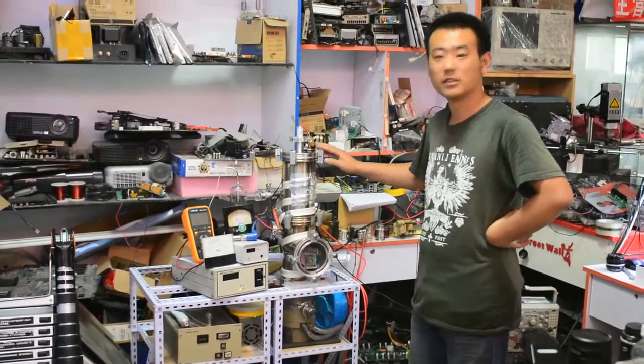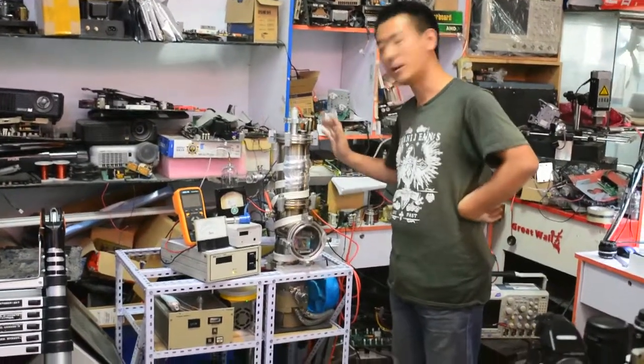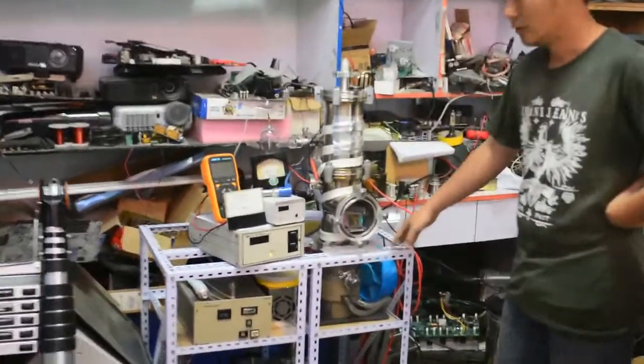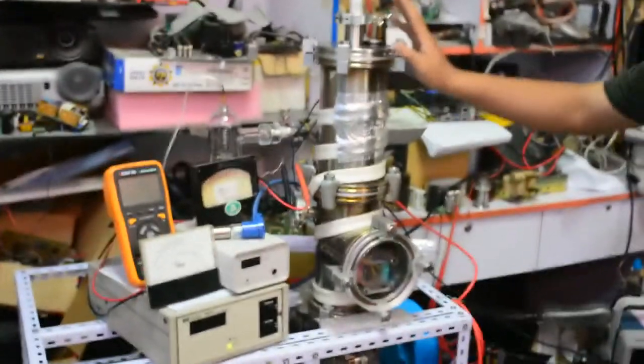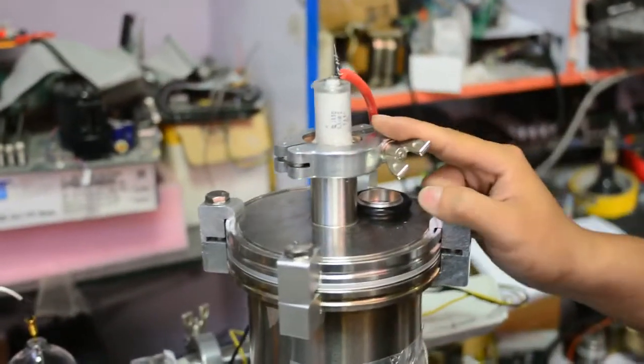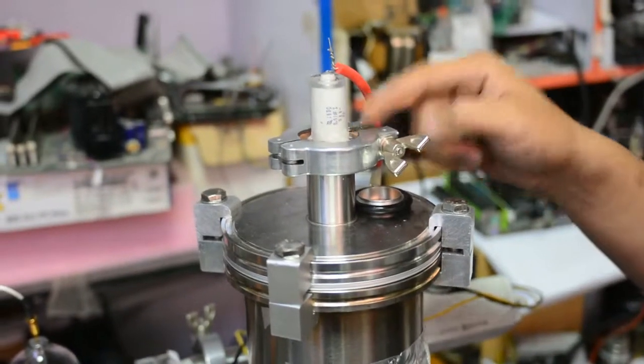Hello everyone. This is my new project — a scanning electron microscope. This is the vacuum system. This is a high voltage connection for the vacuum seal, made by myself with a piece of copper and a high voltage capacitor.